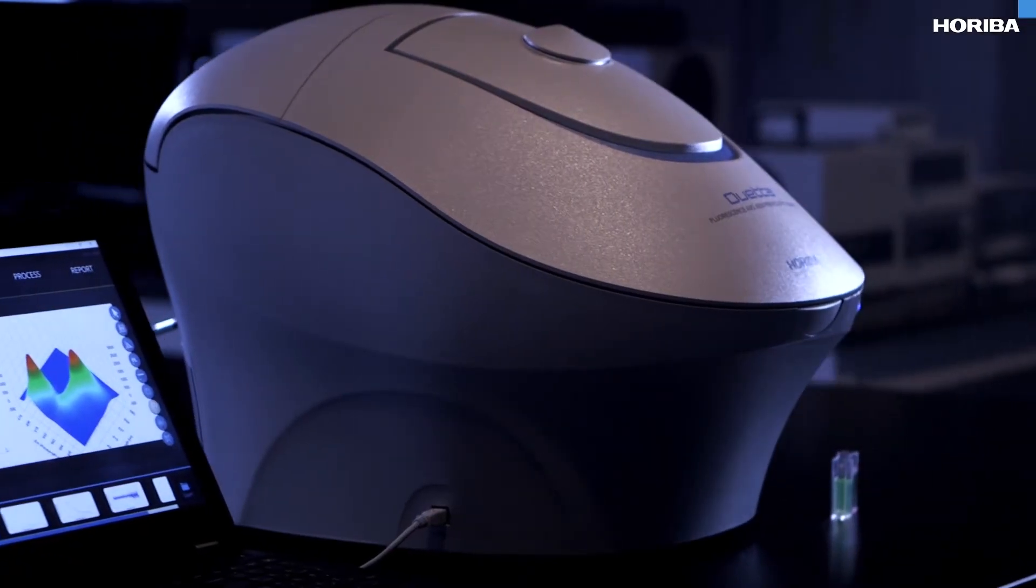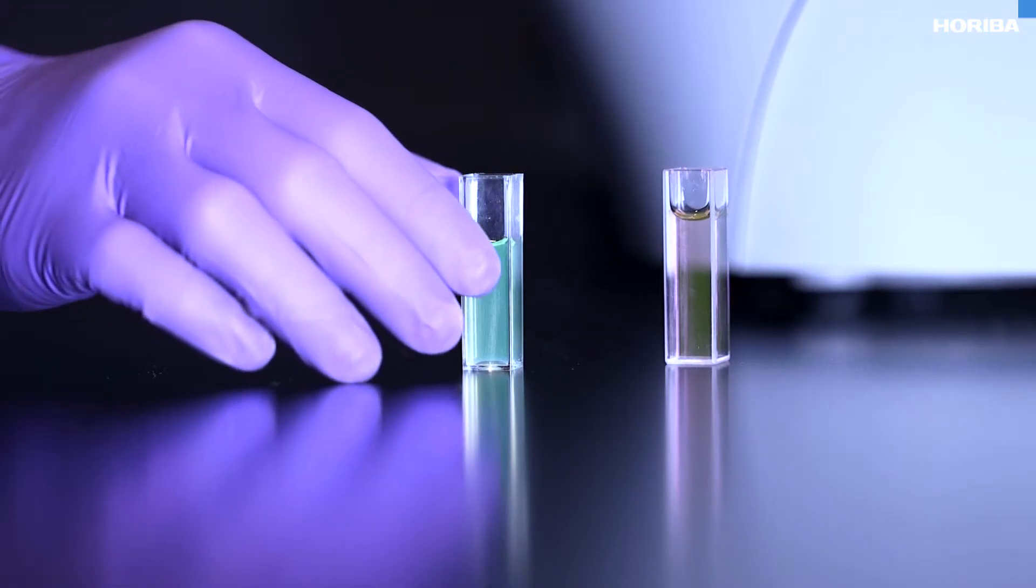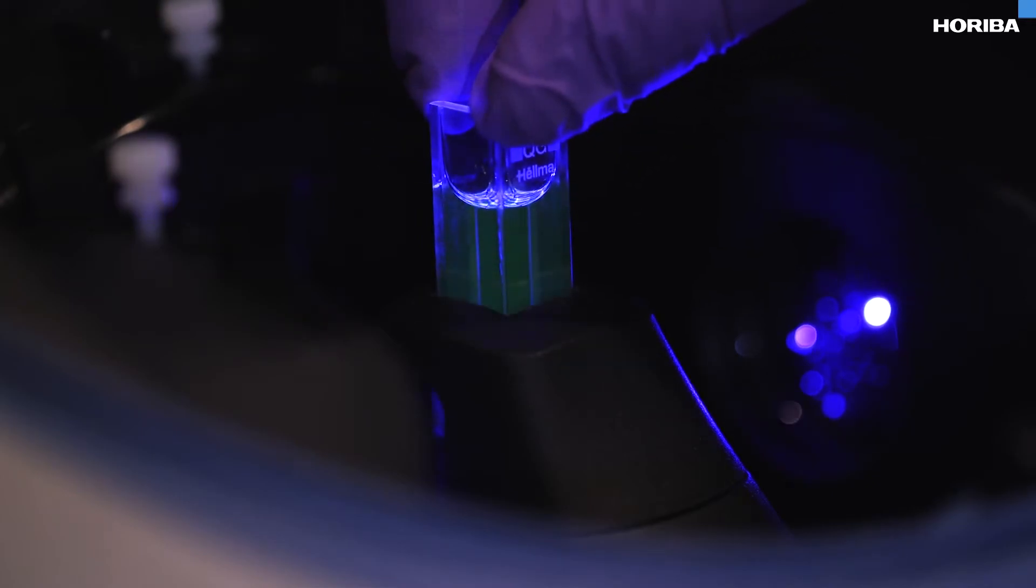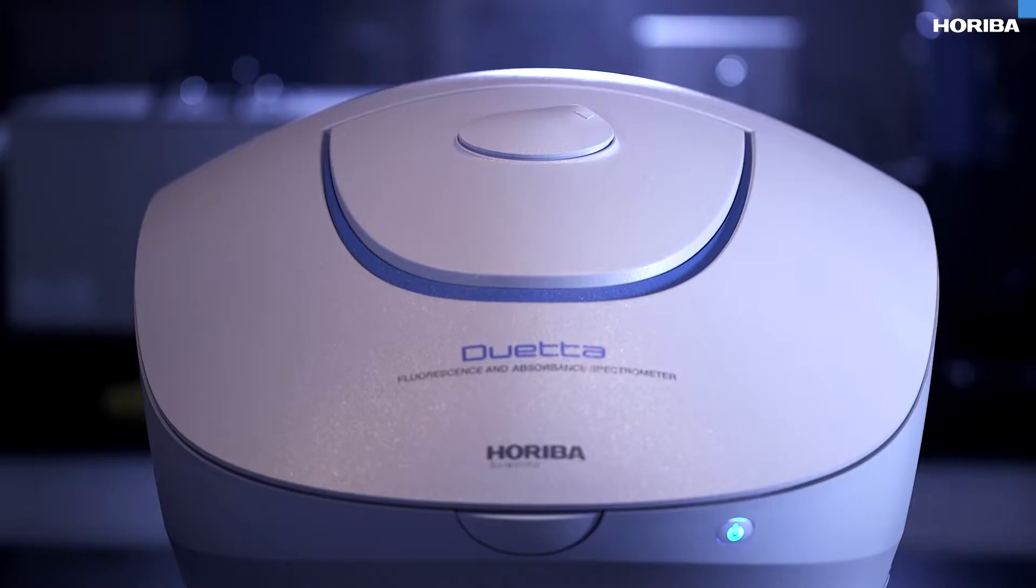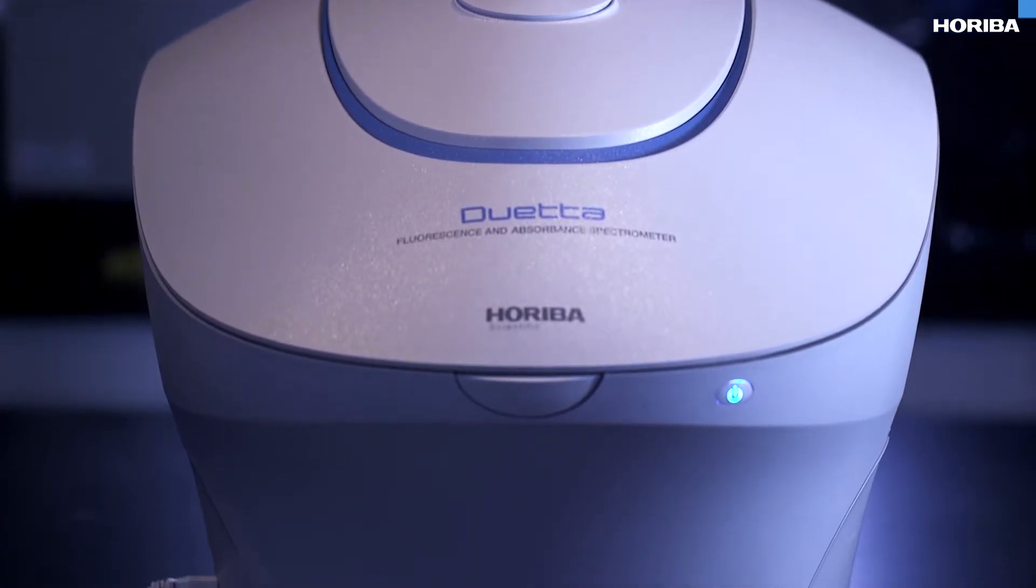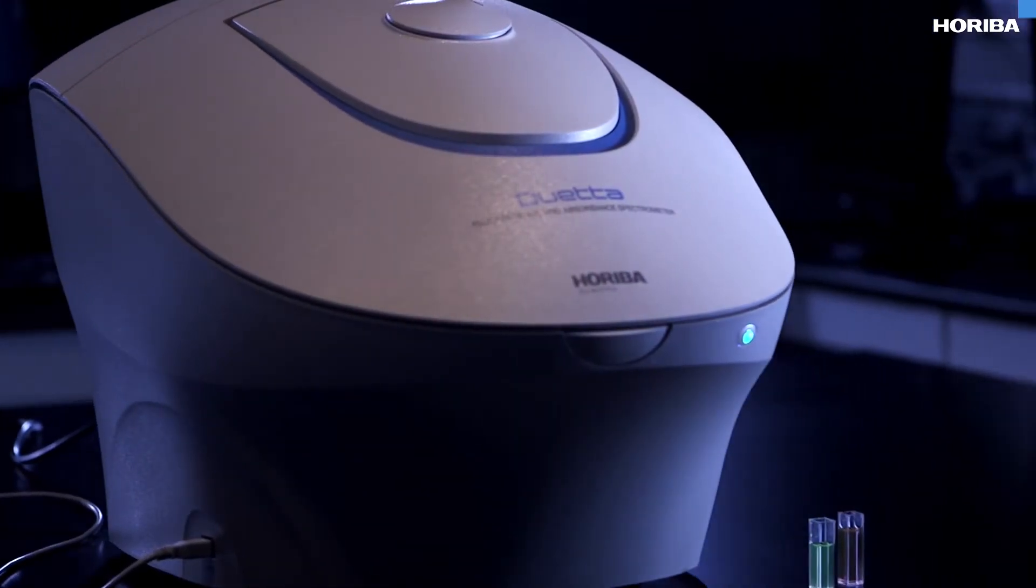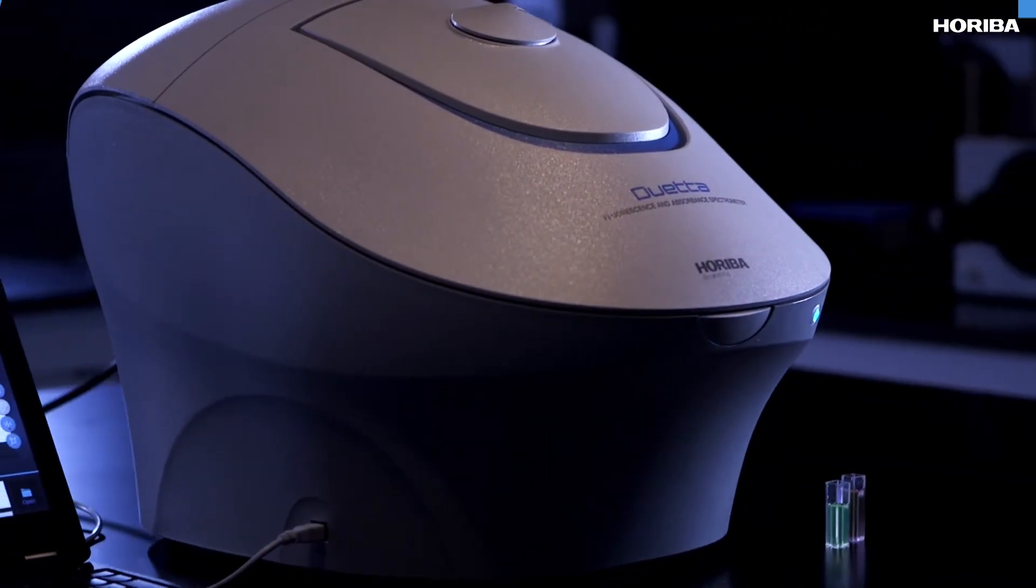The Duetta has transformed fluorescence spectroscopy. It is the fastest system available, combines fluorescence and absorbance spectroscopy for the most accurate data, and offers an extended spectral range for more flexibility. The Duetta is the future of fluorescence. Now!